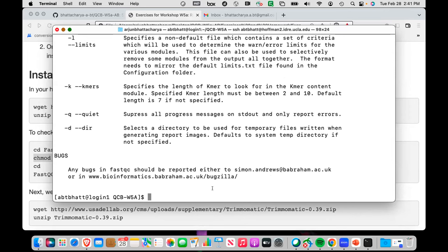So there's supposed to be a lowercase directory? It's an executable. Created a chmod. Yeah, we did chmod here. So when you go to ls, now FastQC is written, so that means executable. So now when you did --help, you can specify what you did --help for. So it's not a folder, but you know it's executable, and now you want to put --help to a specific.